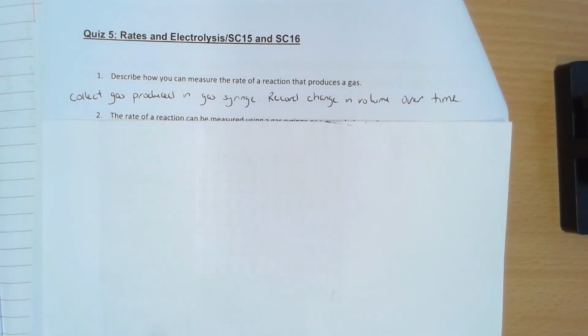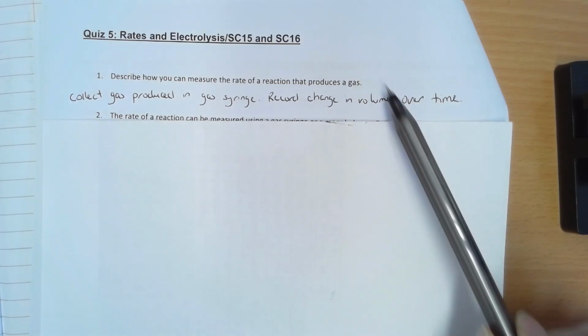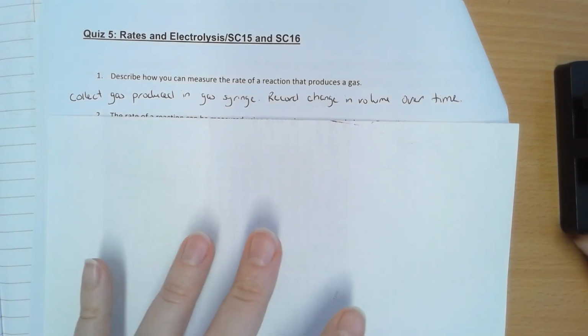All right, how do you measure the rate? I've gone for gas syringe, but you equally could have gone for mass balance. Just make sure you're mentioning time. It's change over time.